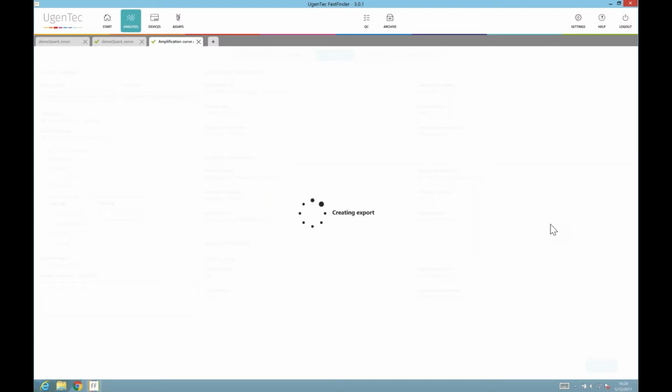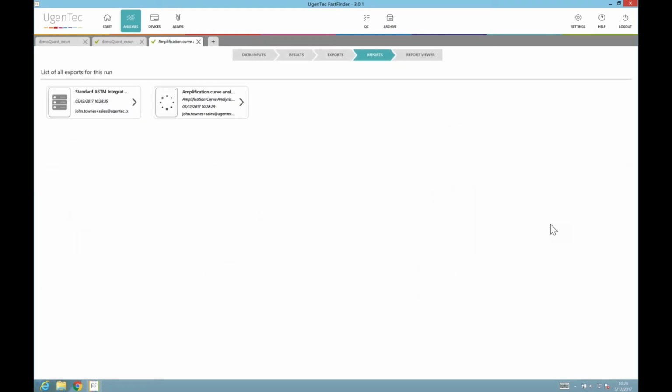So this is designed to have as many features as possible, really to put the control in the hands of our users, so that we're not delivering a product that dictates your workflow, but fits around the existing workflow.